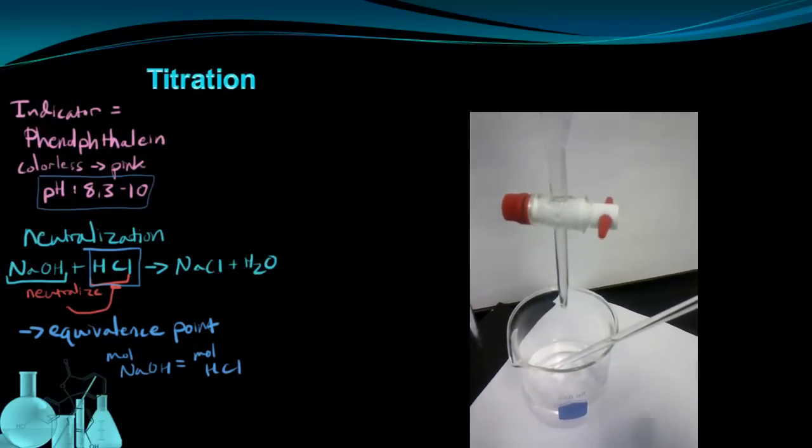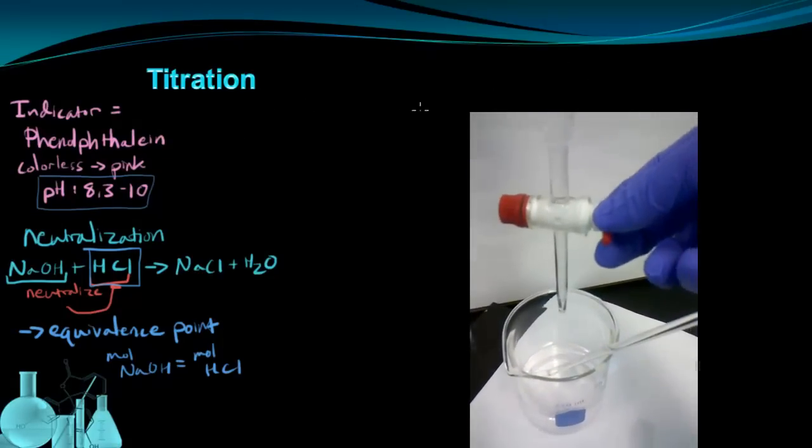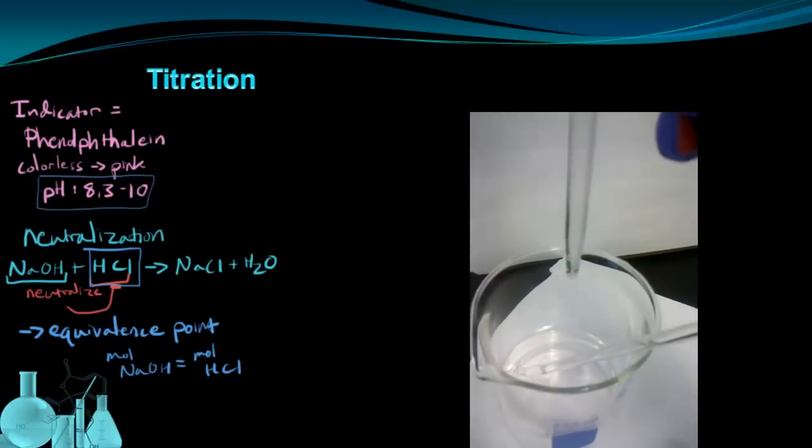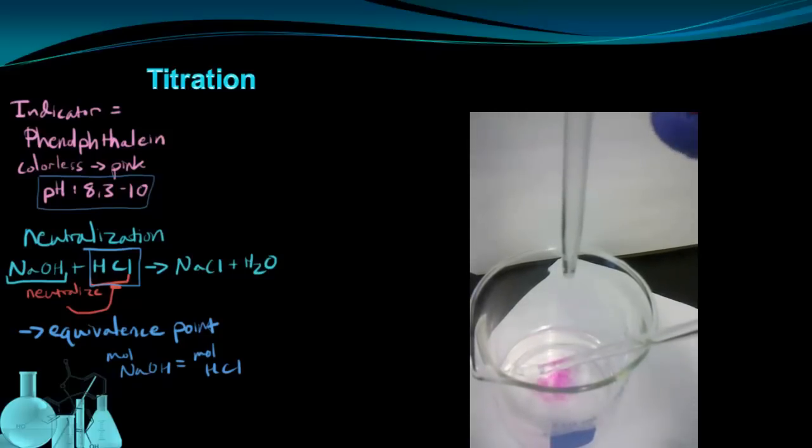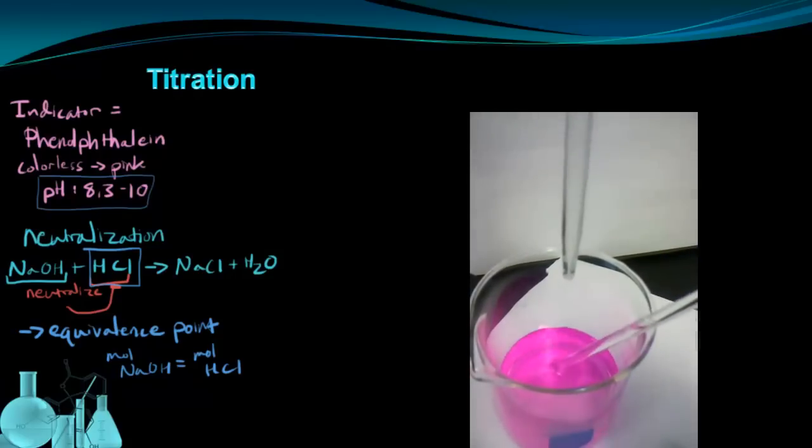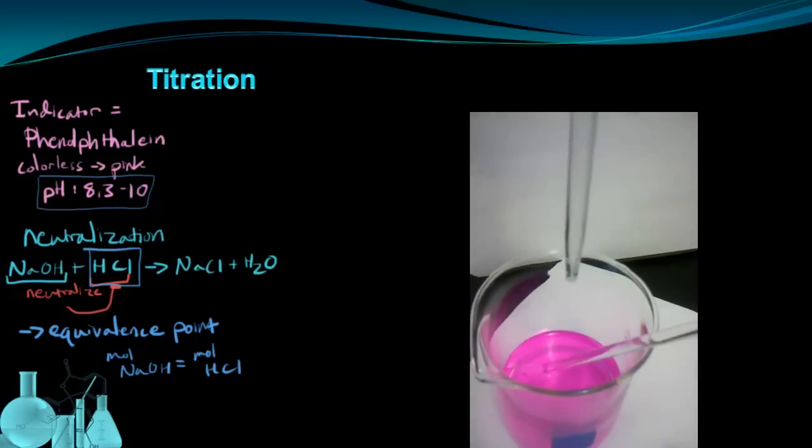Now one more thing I'm going to show you here is that if I had gone too far and I added too much base, as I'm going to do right now, you'll see that instead of having a slight color change, I get this deep, vibrant pink color. If you see this degree of a color change, you've gone too far and you've put in too much base. You've essentially passed the equivalence point by too much.